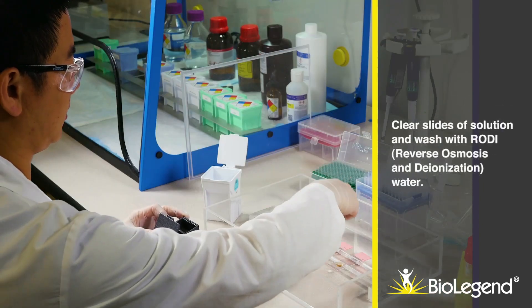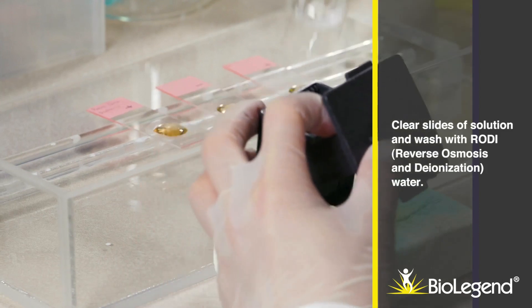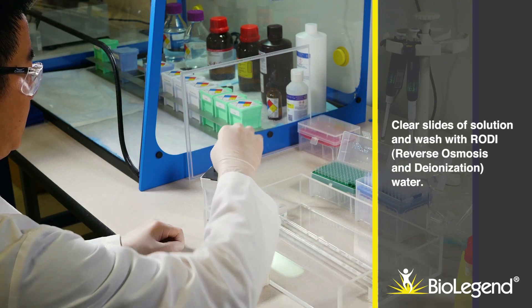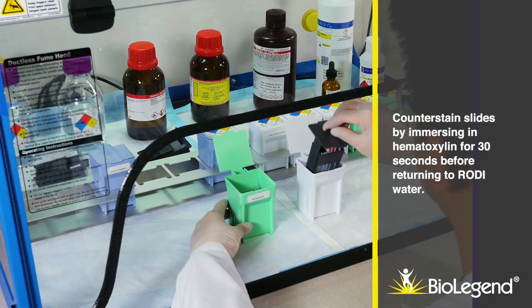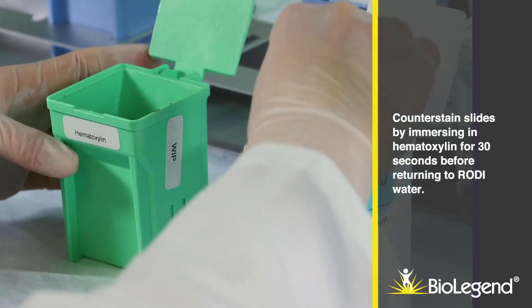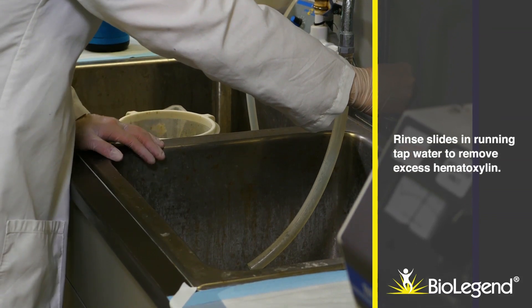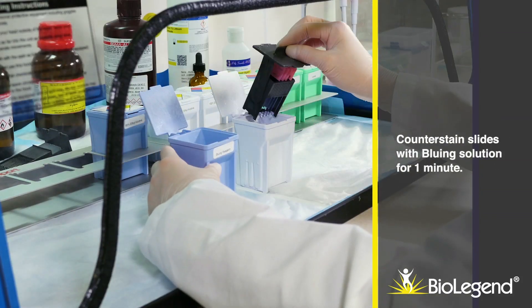Clear slides of solution and wash with RODI (reverse osmosis and deionization) water. Counter stain the slides by immersing in hematoxylin for 30 seconds before returning to RODI water. Rinse slides in running tap water to remove excess hematoxylin. Counter stain slides with bluing solution for one minute.